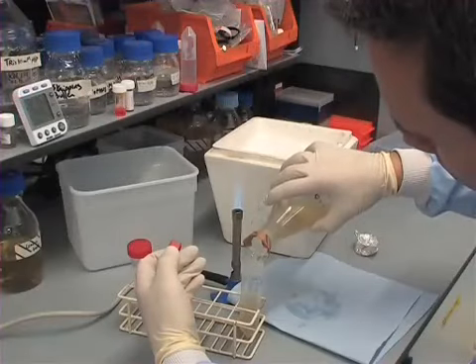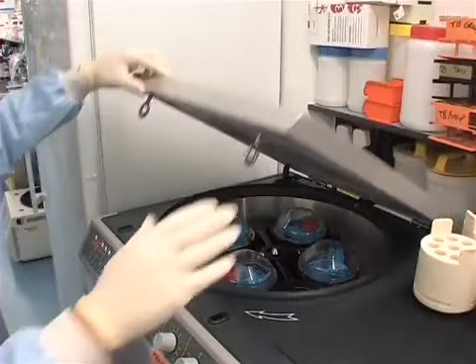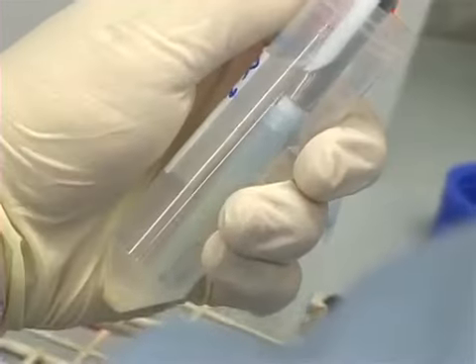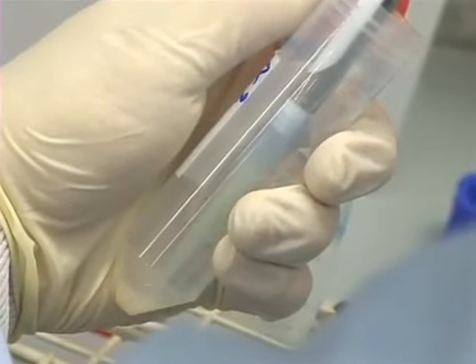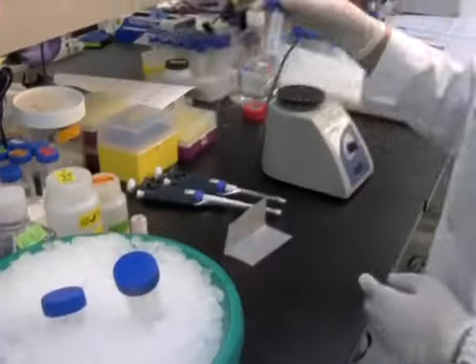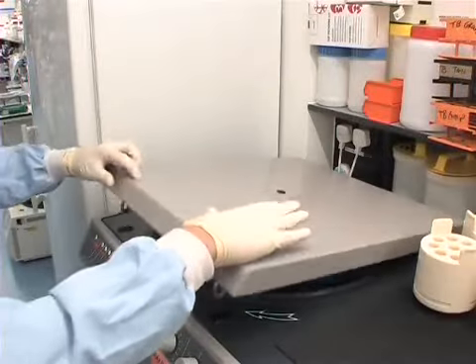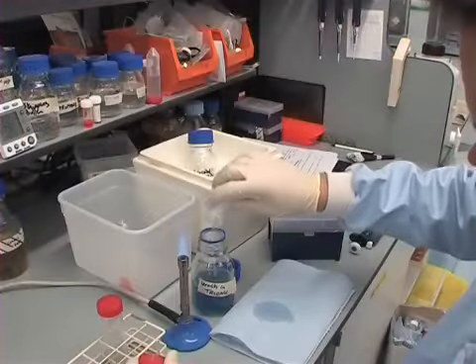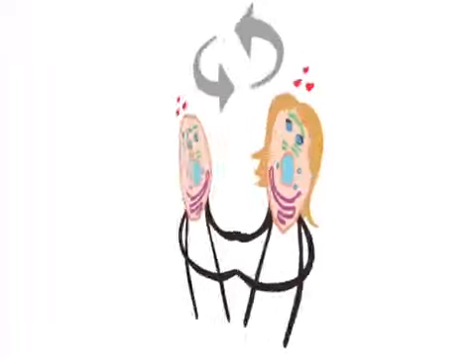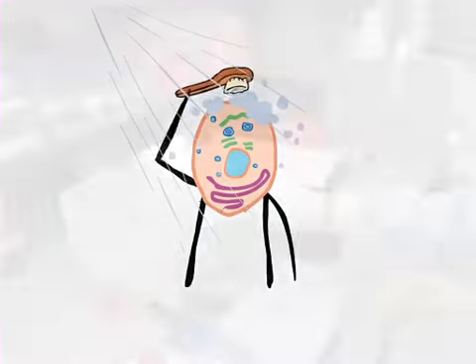Next, separate the bacterial cells into 2 large centrifuge tubes and spin at 4 degrees Celsius. Pour off the supernatant and resuspend in about 100 milliliters of 0.1 molar cold calcium chloride. Then, incubate cells on ice for 30 minutes. This step is repeated at least once more. Cycles of spinning and resuspending cells are often referred to as washing your cells.